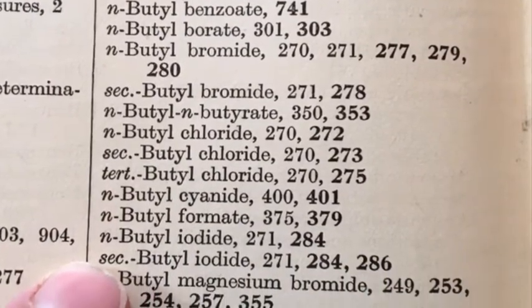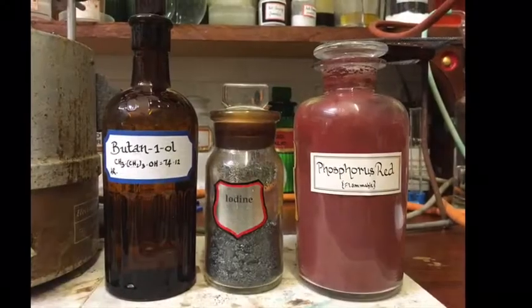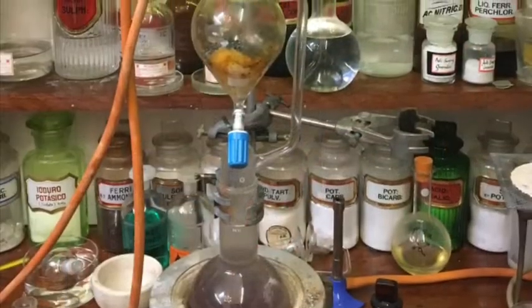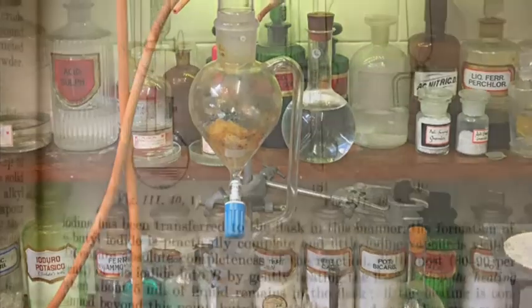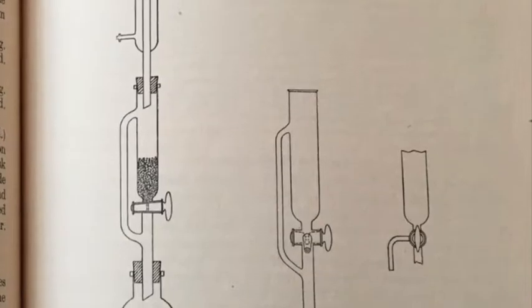One of them was on organic synthesis, and on page 286 of his 1957 edition he has a great method of producing butyl iodide. He uses a special piece of equipment which is an equalizing separating funnel.